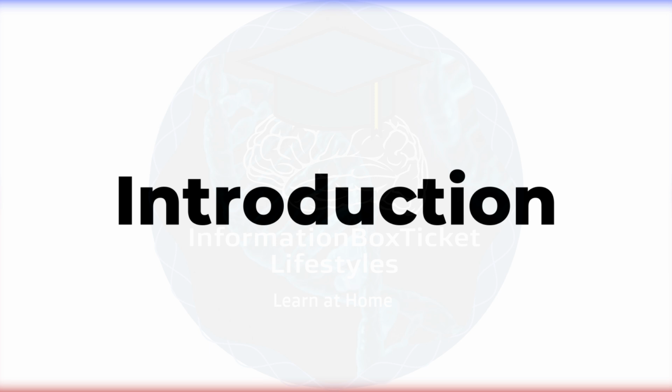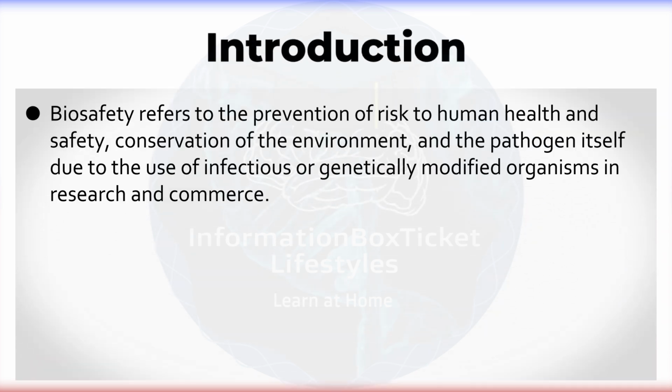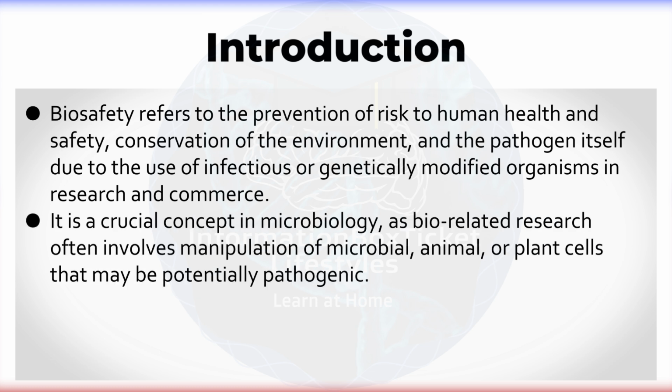Introduction to Biosafety Level. Biosafety refers to the prevention of risk to human health and safety, conservation of the environment, and the pathogen itself due to the use of infectious or genetically modified organisms in research and commerce. It is a crucial concept in microbiology, as bio-related research often involves manipulation of microbial, animal, or plant cells that may be potentially pathogenic.